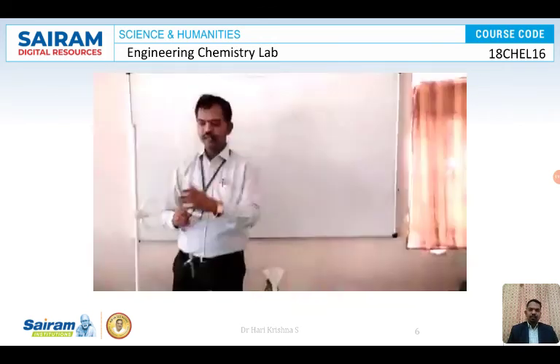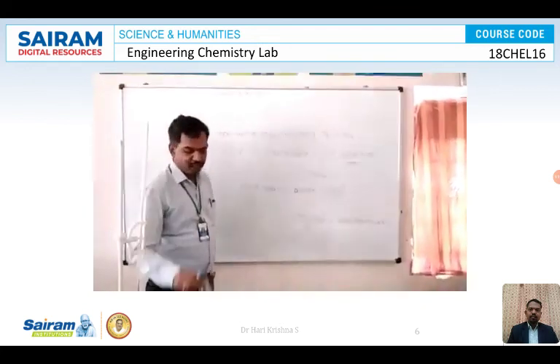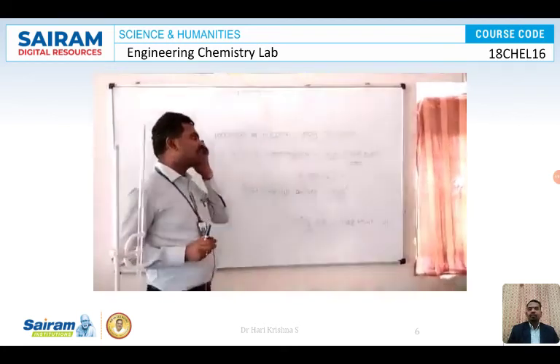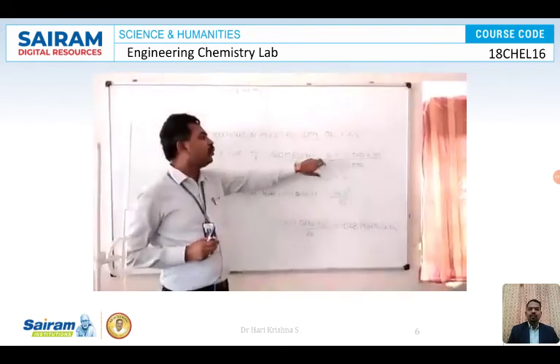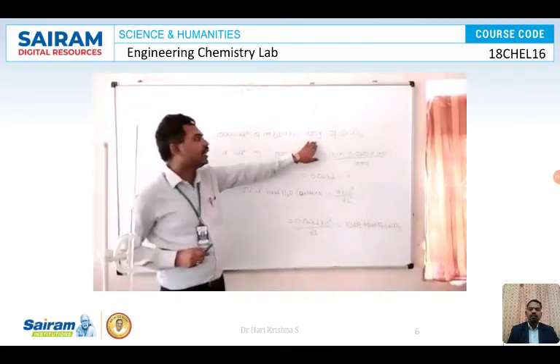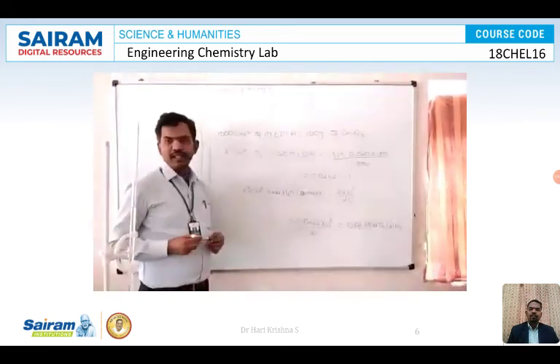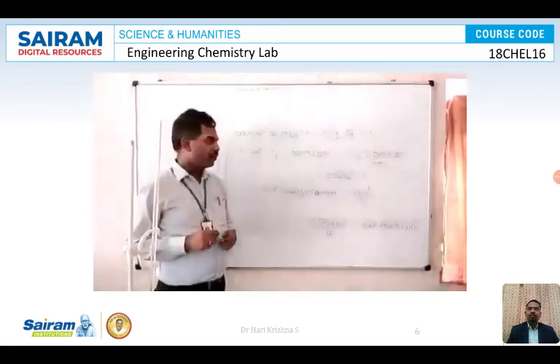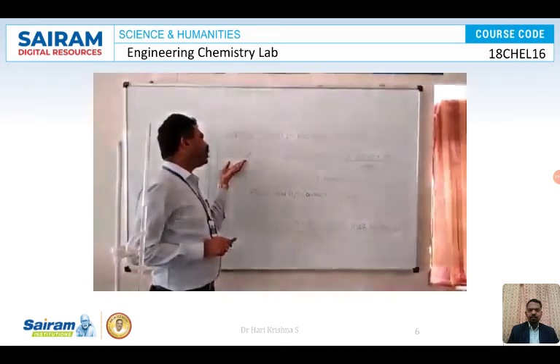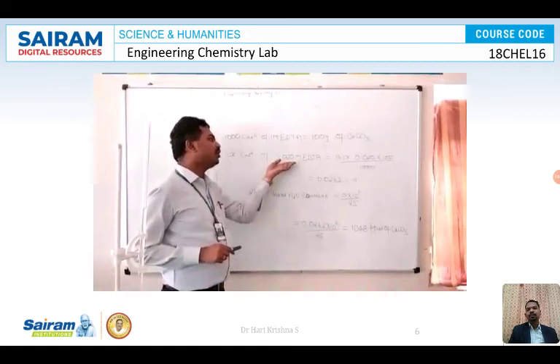Okay. So we have got the complete titration and we got the end point as 13.1. The concordant values were 13.1 and 13.0. So the concordant value was 13.1. The 1000 cm³ of 1 molar EDTA contains 100 grams of calcium carbonate. So for X cm³, X cm³ means the volume of Na2EDTA run down. The volume of Na2EDTA run down was 13.1 cm³, and the molarity of EDTA was found to be 0.020 molar.